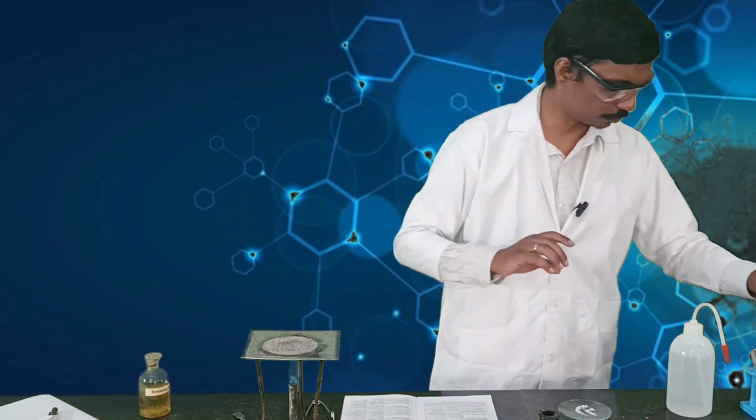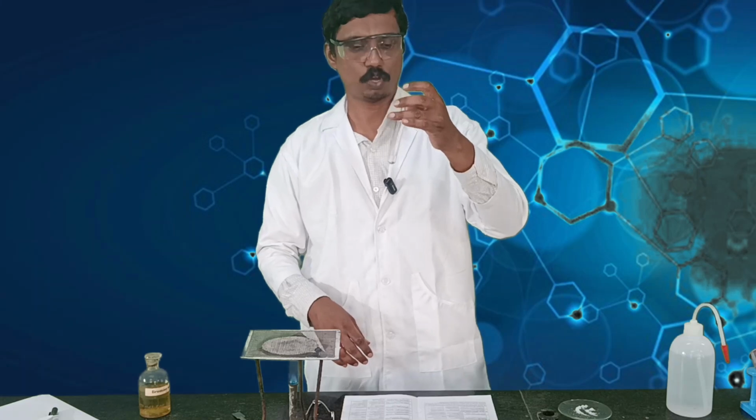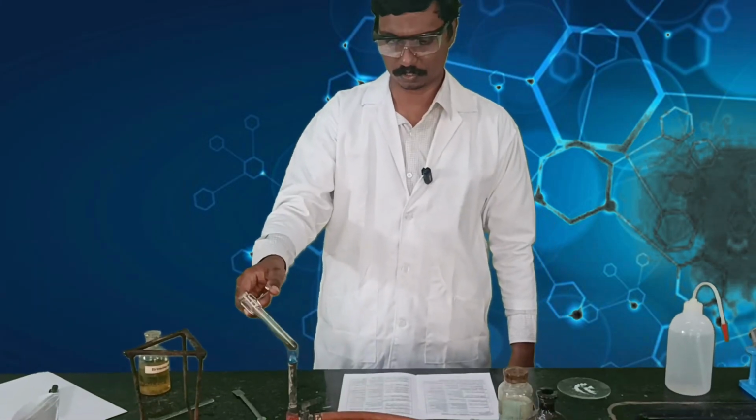So now we will do the test for the presence of nitrogen. From this extract you take some amount, and then you have to add ferrous sulfate, like 1 spatula of ferrous sulfate. So I'll add 1 spatula of ferrous sulfate. Shake well so that it's completely dissolved, and then you heat this for a while, till you observe that it's boiling.